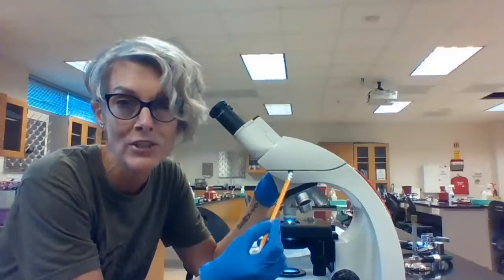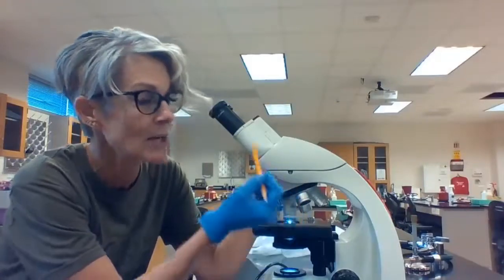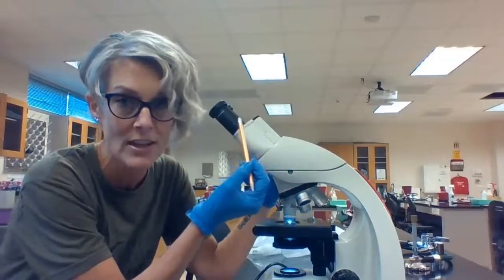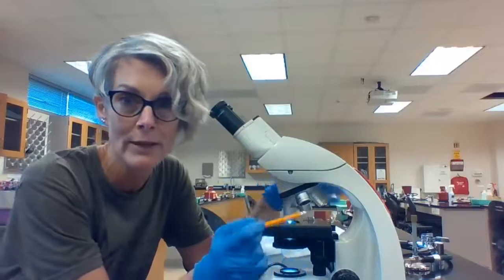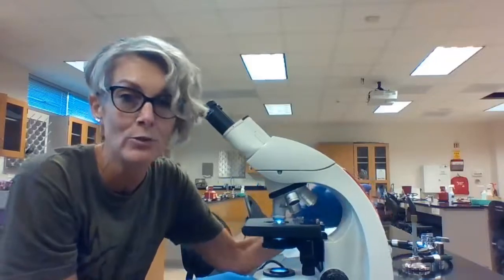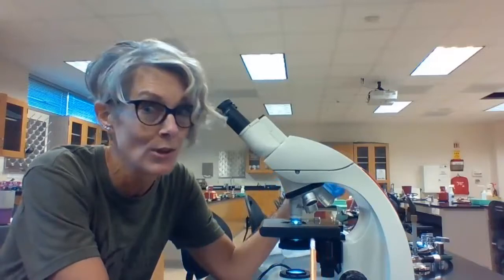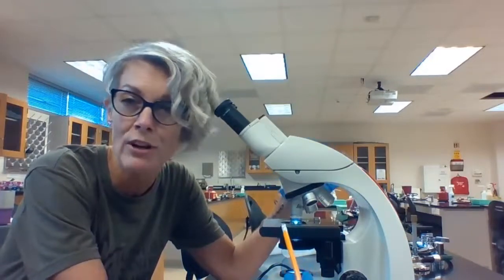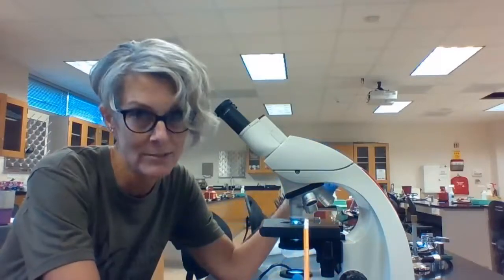This is the body tube. The body tube contains mirrors that reflect the image through our lens up to our ocular lens. This is the reason we always want to be really careful with the microscope — this is why we have it on a paper towel mat so we can move it without jarring it. These mirrors are in alignment. Any sort of jarring or tilting of a scope can move these mirrors and that's going to affect our image.